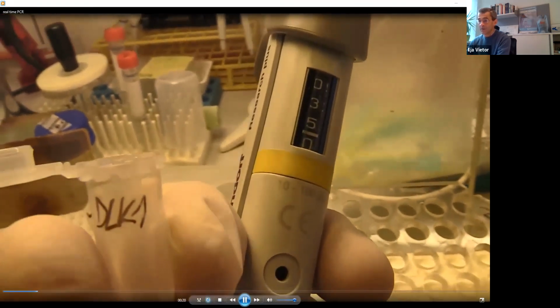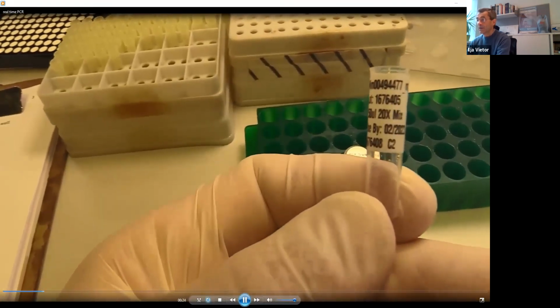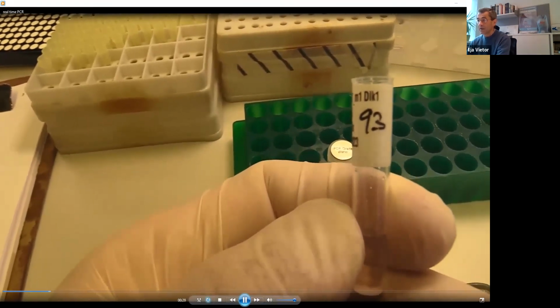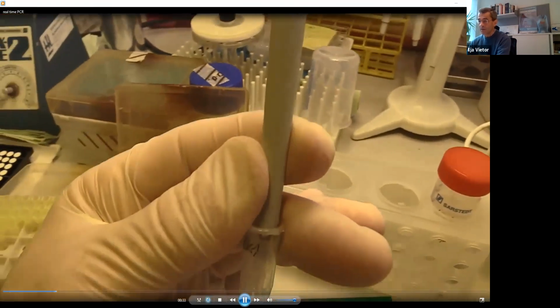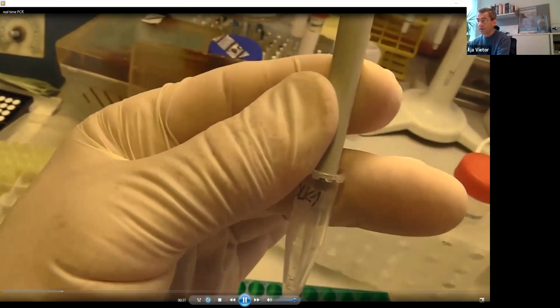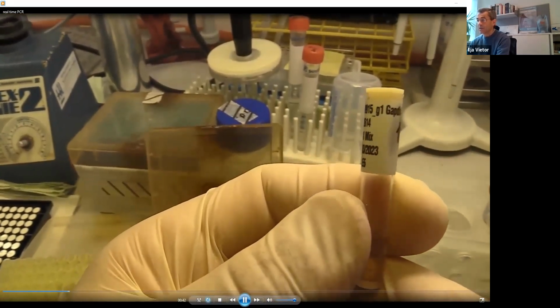And then we put this 35 into the master mix tube and mix it with the specific probe. You can order ready-made TaqMan probes, in this case for DLK1. Mix it together and then pipette into the specific PCR tubes. The second one is GAPDH.